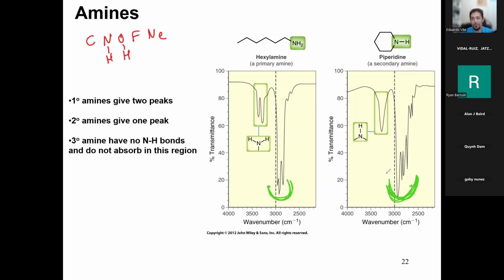And you have the structures, so you can tell me what kind it is. It's an sp3 CH stretch. Yep, that's right. You've got to give me that answer if you know the structure, because otherwise it's not going to be full credit. You need to tell me that based on the structure, this is an sp3 CH stretch.